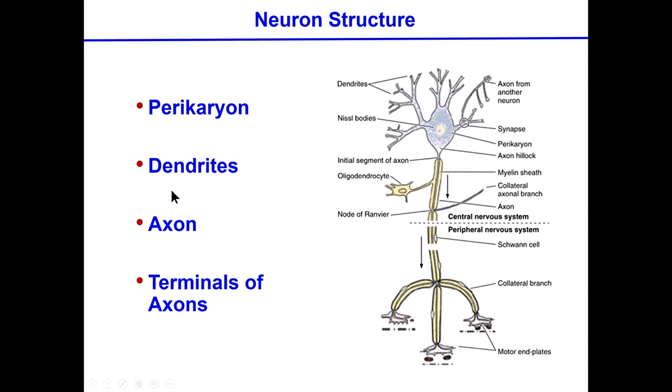I already mentioned before the dendrites. The dendrites are these processes which are short, and in the case of this neuron, which is a multipolar neuron, has many ramifications, and is allowing this neuron to interact with a number of other cells. And then we'll talk about the long process. The long process is the axon. And guess what? This one says that it has an oligodendrocyte around the axon. So this one is most likely in the central nervous system as opposed to being in the peripheral nervous system, because otherwise it would be a Schwann cell.